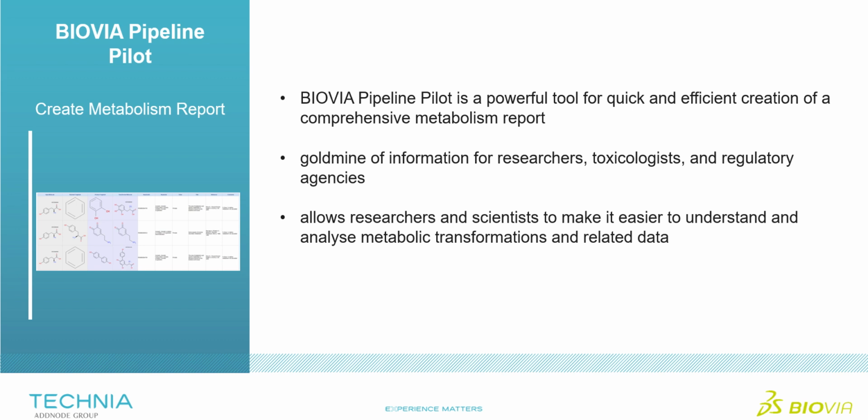This metabolism report is a goldmine of information for researchers, toxicologists, and regulatory agencies. It aids in decision making processes, safety assessments, and drug development strategies. BIOVIA Pipeline Pilot empowers us to create detailed and informative metabolism reports, making it easier to understand and analyze metabolic transformations and related data. It's a must have tool for researchers in the field.